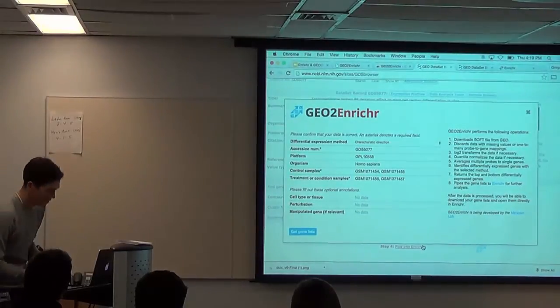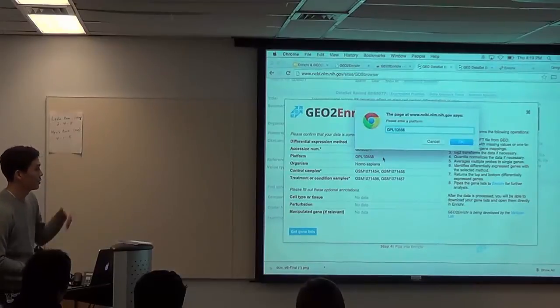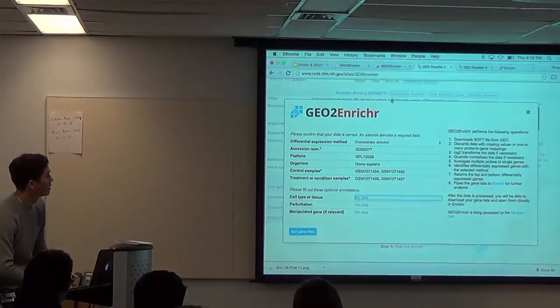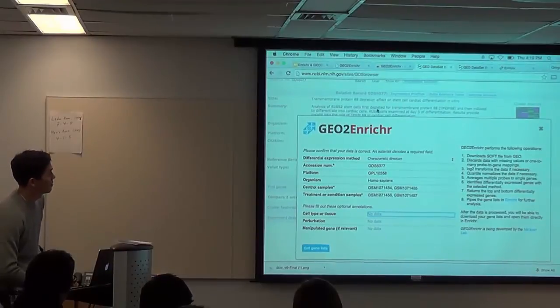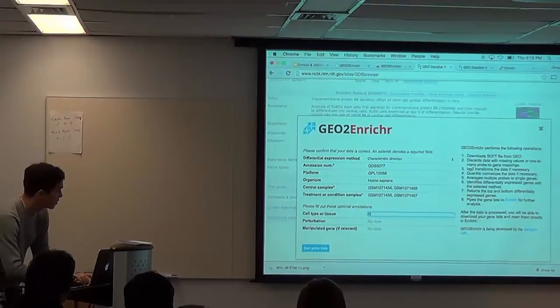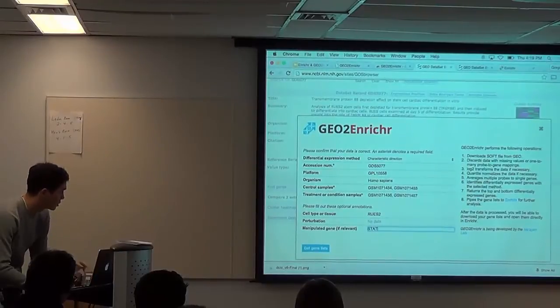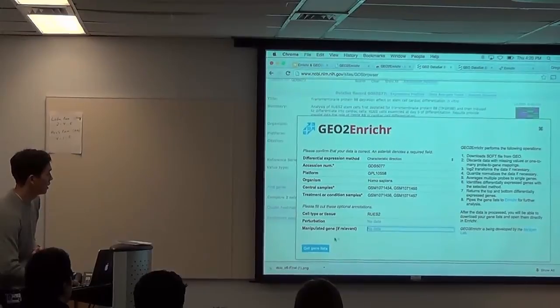Because I'm screen scraping, I'm aware that I could have made a mistake. You can click on something and edit it if you'd like. And then to insert data, in this case, you can see it says transmembrane protein 88 depletion effect, et cetera, et cetera. You could add something like that if you wanted to. I'm not sure what the gene is in this case, but just to show you, there's some autocomplete as well for you.